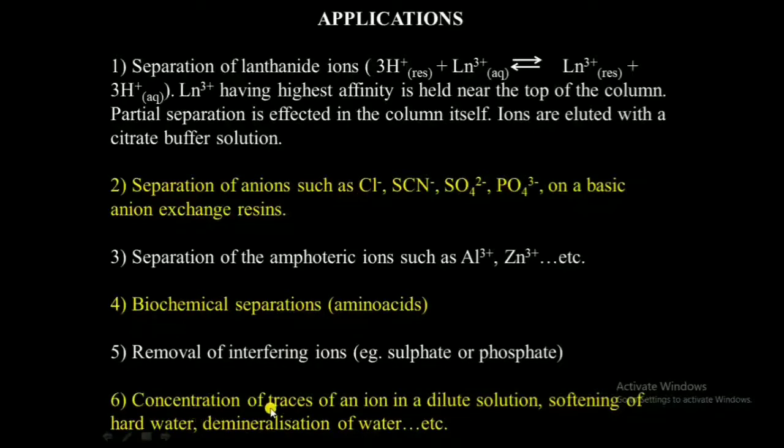Then concentration of traces of an ion in a dilute solution. It means if you have a mixture where a particular ion is very low in concentration, you conduct this separation for different mixture samples so that you get that ion separated, and you add all those fractions so that you get a higher concentration of that particular ion.